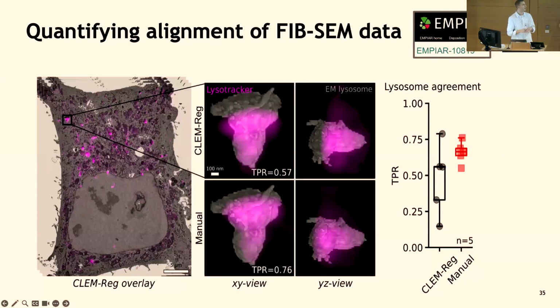And in general, when we segment the fluorescence microscopy, the structure is similar, but there obviously isn't a one-to-one point cloud between the two. So the registration is never going to be as perfect, and that's why we expect that being able to manually select landmarks, where you can spend your time and find the things that look best, will garner better results. Yeah, sorry, was there another question?